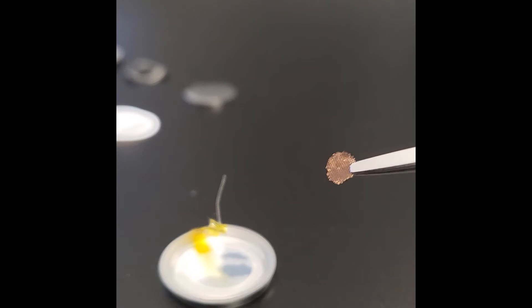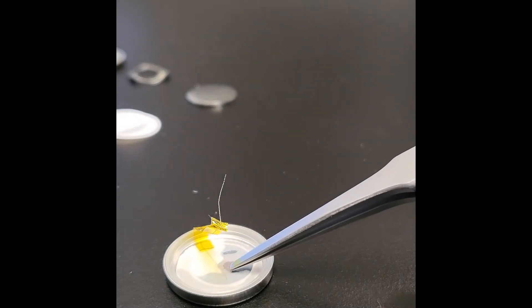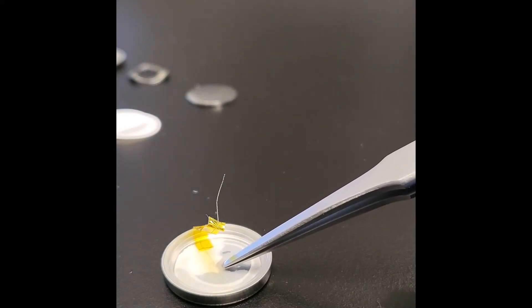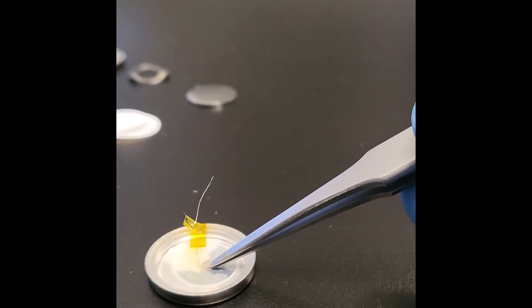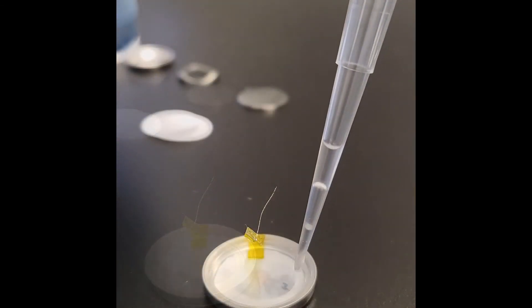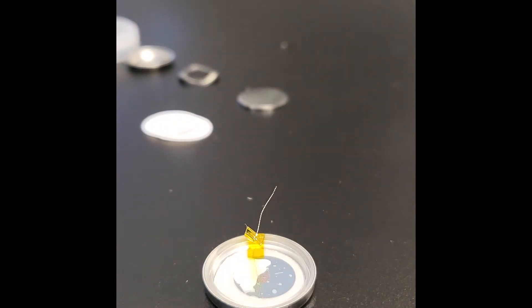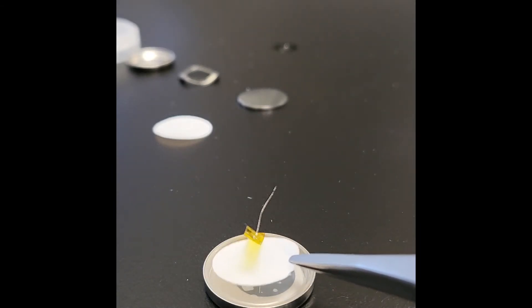Now grab the copper mesh and place it underneath the stainless steel wire, trying to keep it centered. The goal is to have the mesh close to the center so that it doesn't go outside of the electrode sheet area. More electrolyte can be added at this point, but be careful not to add too much, otherwise the mesh might float away from the desired position. Add separators to cover the mesh — feel free to double the separator if you like.